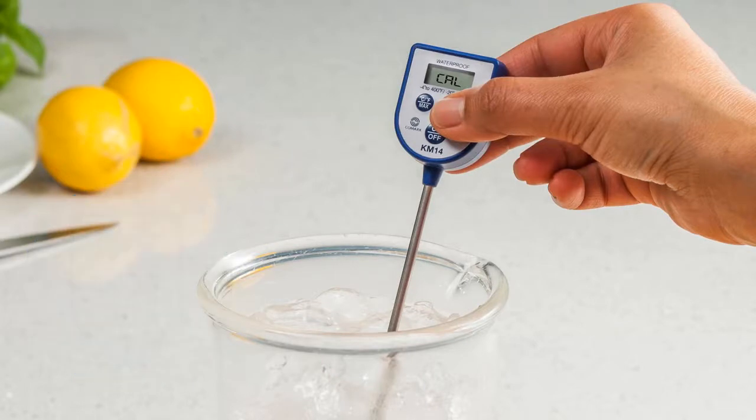The digital display should show the CAL message for around 2 seconds, after which the recalibration to 0 degrees Celsius or 32 degrees Fahrenheit will have been completed.